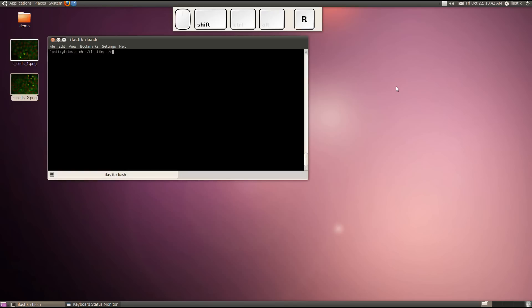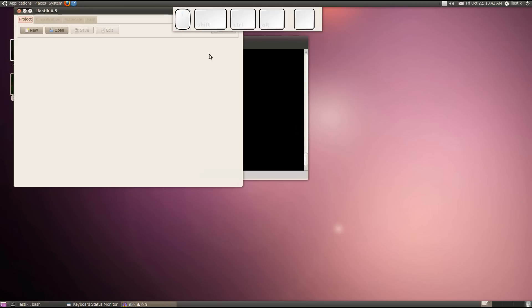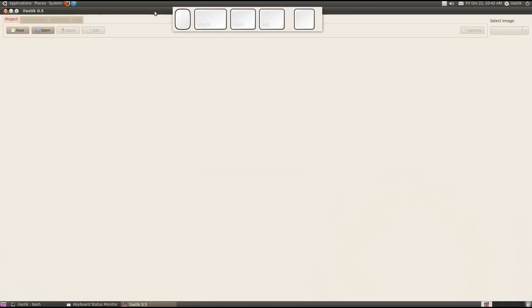First of all, let me start ilastik and maximize the window. To process images in volume, we first have to create a new project.